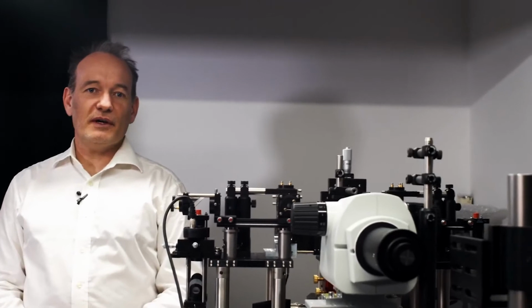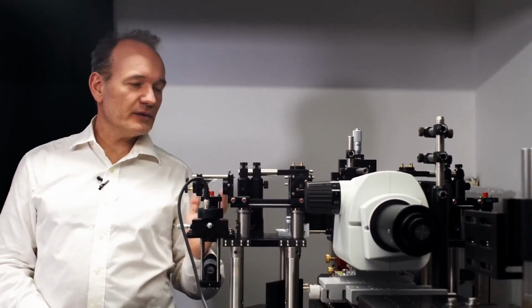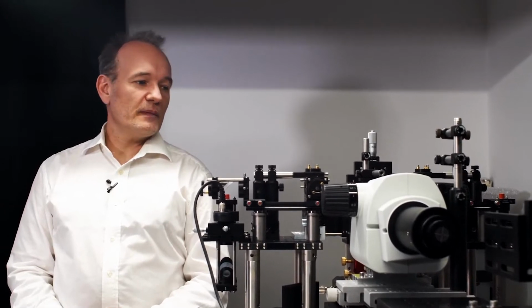What you see here on my left side is actually a mesospin light sheet microscope developed by Fabian Voigt from the University of Zurich. We have duplicated his approach, which is openly available on the internet, and modified it with some minor details to fit our needs. It's a very interesting microscopy technology as well, and we are looking forward to see what we can get out of it. Anyway, let's come back to our multiphoton microscope.